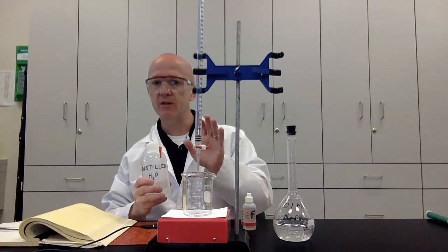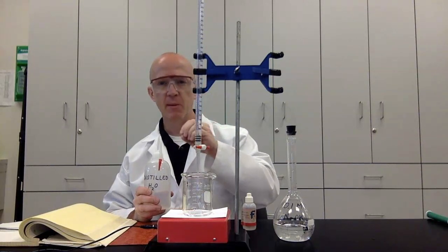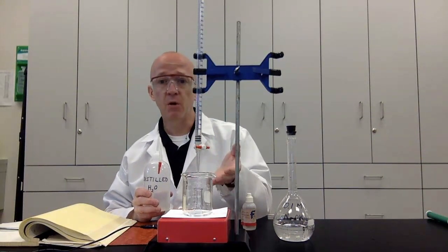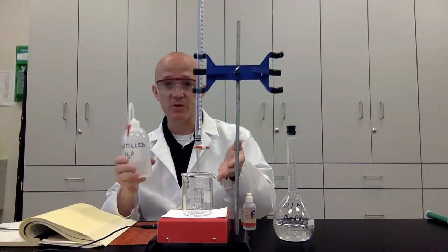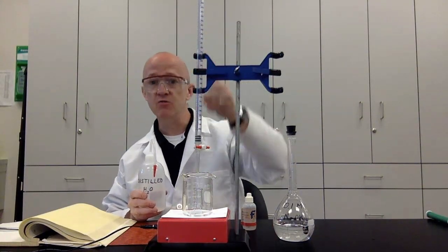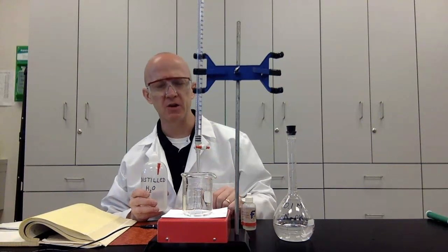Now if you're wondering about the concentration, it's okay. Here's why. I know exactly how much volume I put in. Remember, molarity is in moles per liter. So I know exactly how much volume I put in, and the moles aren't going anywhere. I'll have the same amount of moles in there regardless of how much water I put into it. Does that make sense? So once I understand how much I needed to neutralize this acid, then I can use that information and come up with a molarity. I think you'll see what I mean in just a moment.